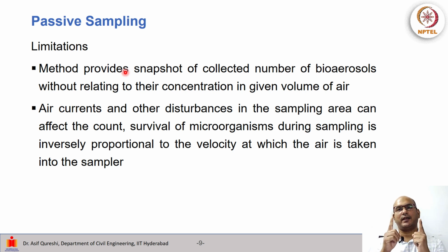So this method provides the snapshot of the collected number of bioaerosols, and we are calculating the colonies. So it does not necessarily relate the measurements or observations to the concentration of bioaerosols in the given volume of air.